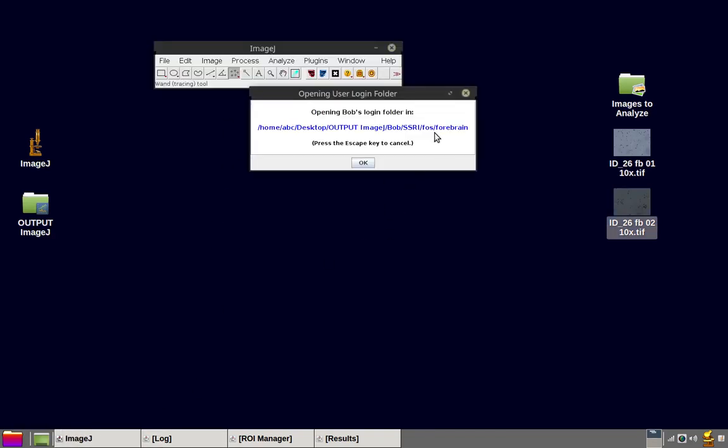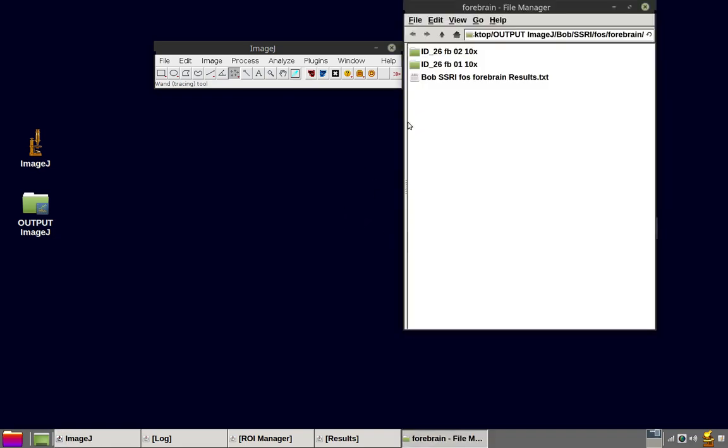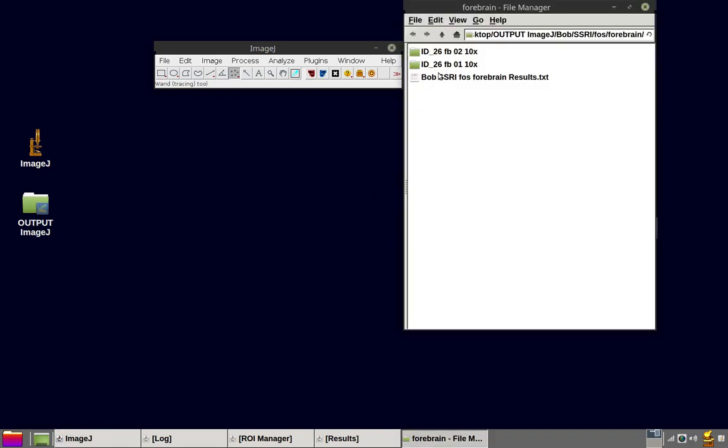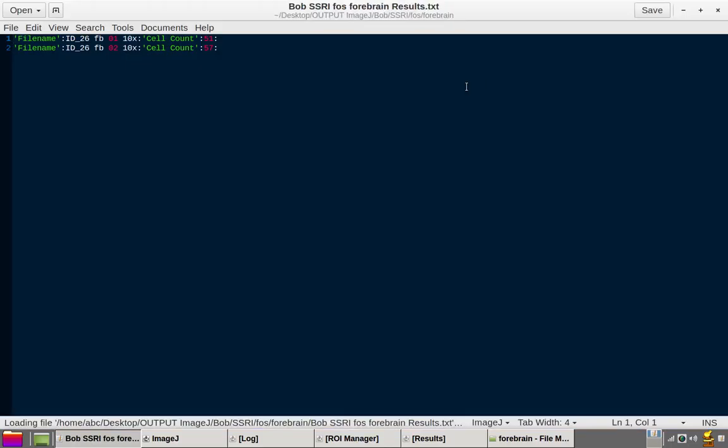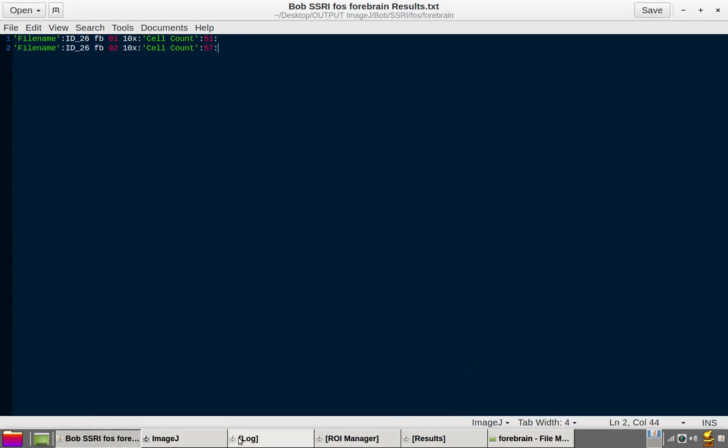Let's open up our results file again. You can see that there's another folder that's been added. And now we have a second result line amended. 57 points.